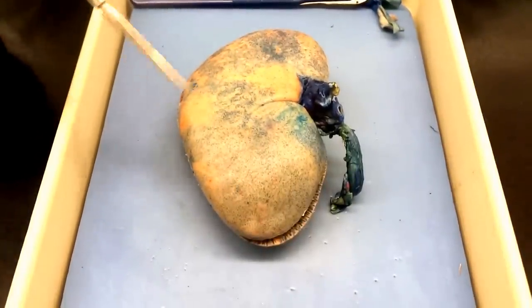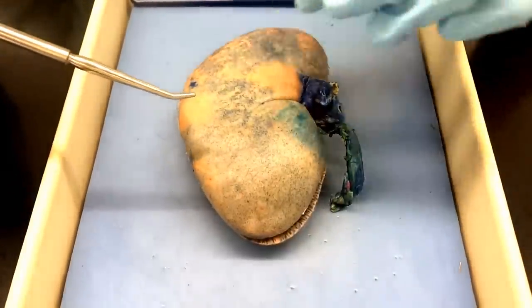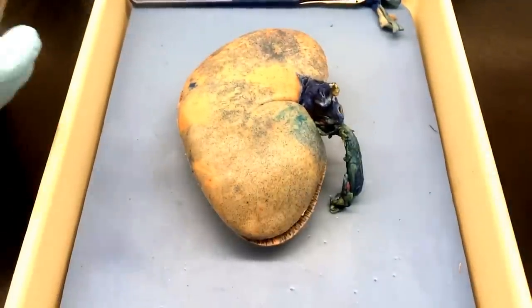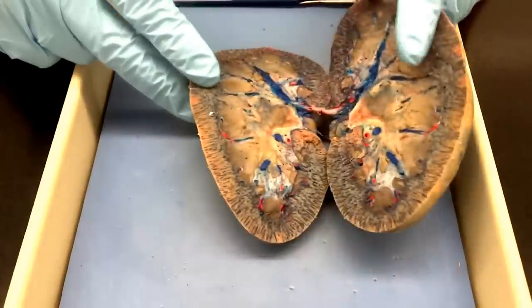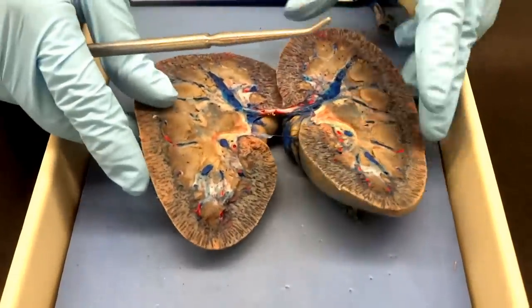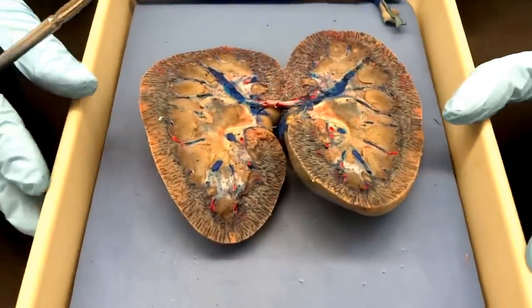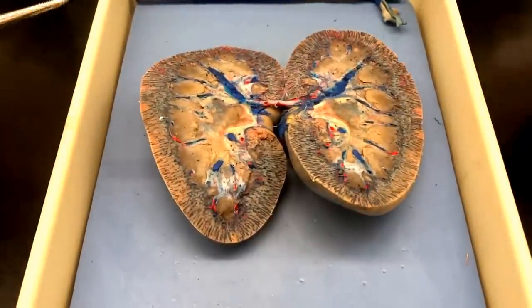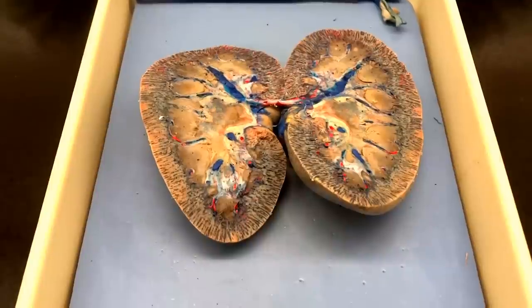And then the renal capsule, which is gonna wrap around the outside of it — if you peel off the little layer, you can see it. Pretend peeling. Let's open that thing up. And magically — we did a little pre-filming dissection here, folks. So you guys are going to open your kidney up basically like a book during the dissection. And these are stained, so you can see the blue ones are the veins, the red vessels there are the arteries.